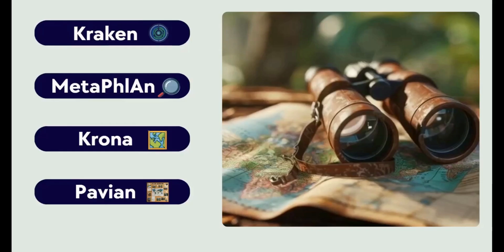About its advantages, it's super fast and gives us a wide overview, like a radar picking up movement. But the negative point is that Kraken 2 might not always be that accurate or precise. You can think of it like studying. If you are studying a chapter rapidly, you're not doing your job accurately. So Kraken is fast, but not always of the accuracy we need, or of the highest accuracy.